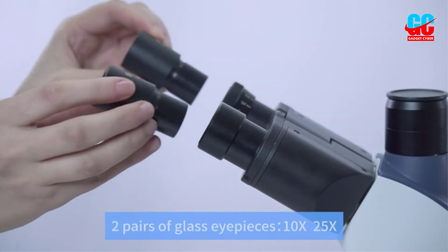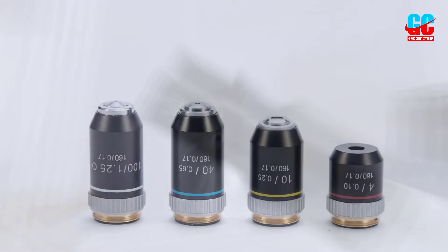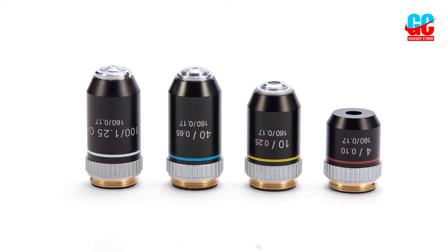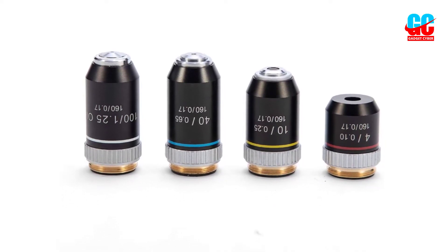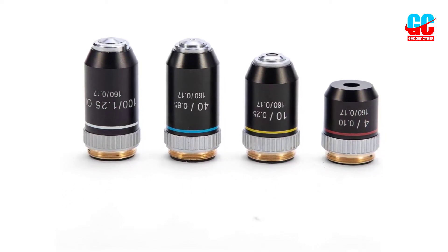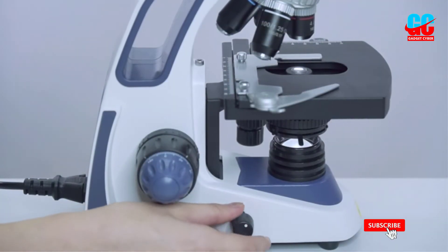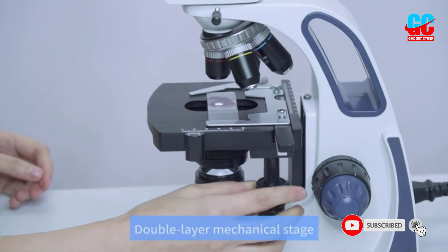It's got a pretty high sticker price, but after feeling the quality and realizing how many features are packed into this device, you'll see that it earns the premium price tag. Dual eyepieces make it much easier to see clearly and bring things into focus. It's also much more comfortable to use, since you'll never have to squint or constantly readjust to find the right angle.